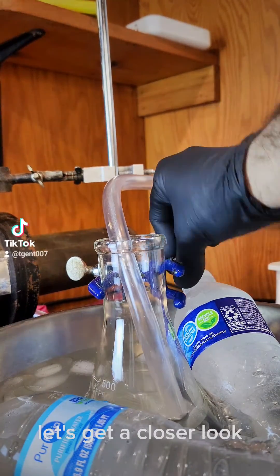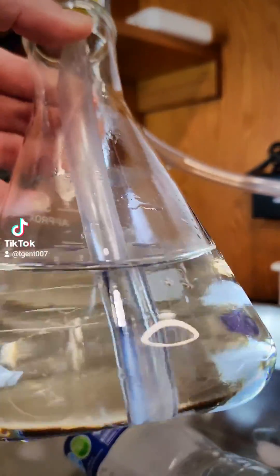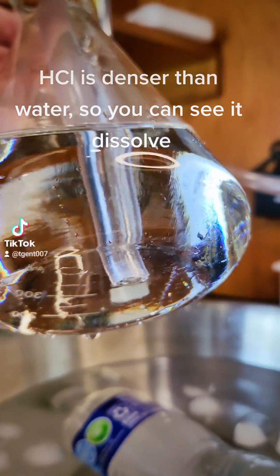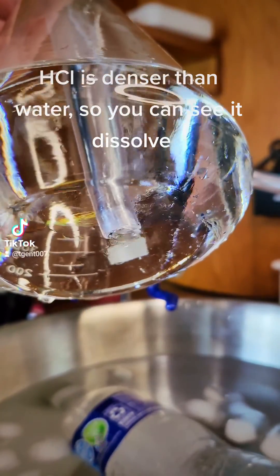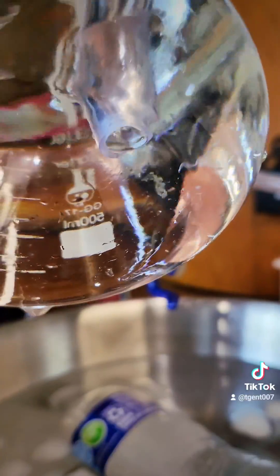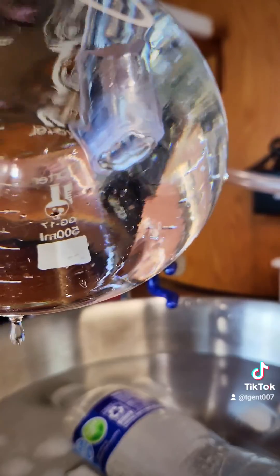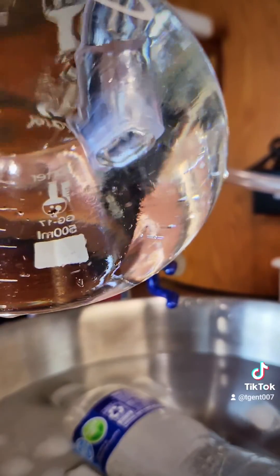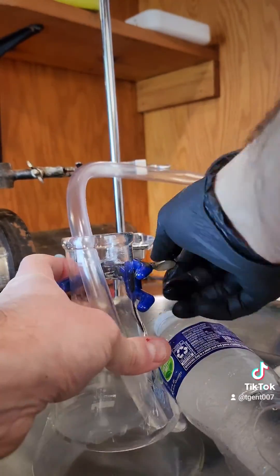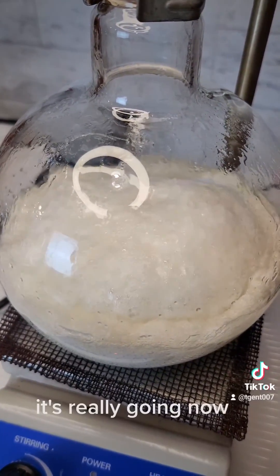Let's get a closer look. HCl is denser than water, so you can see it dissolve. It's really going now.